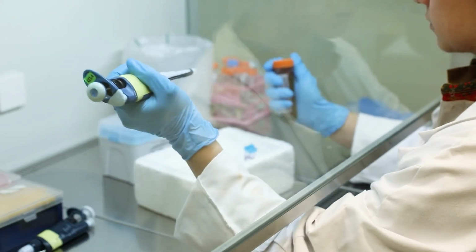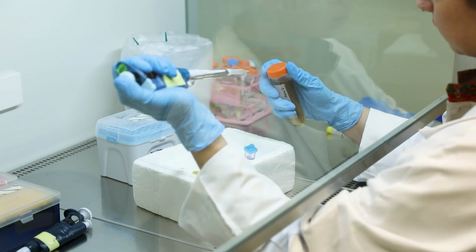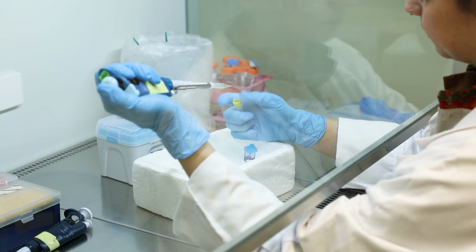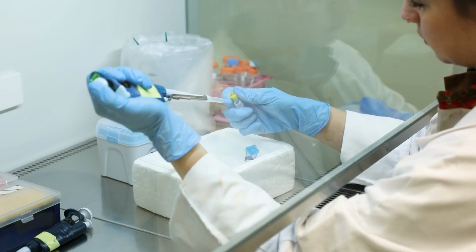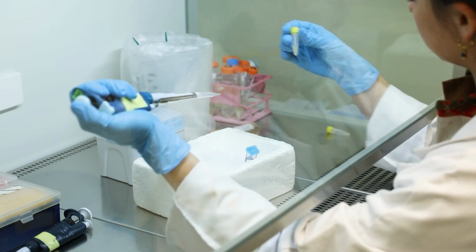And then around 300 microliters of bacterial culture medium, LB or equivalent, is added to the transformed cells. The mix is then transferred into a new clean and sterile Eppendorf tube, and the cells are incubated at 37 degrees Celsius for an hour under vigorous shaking.